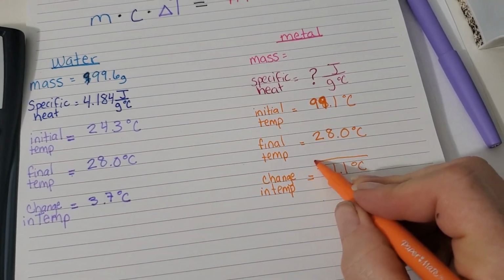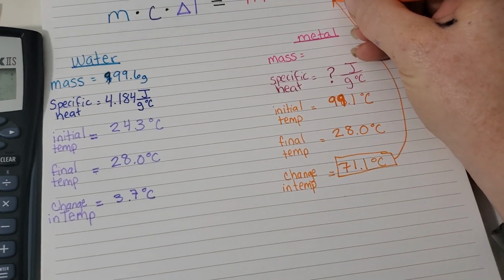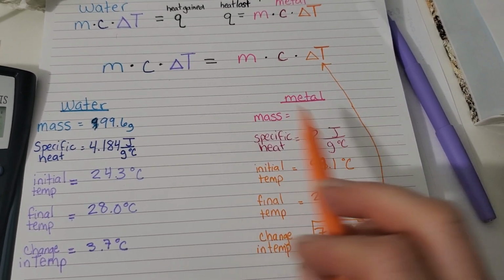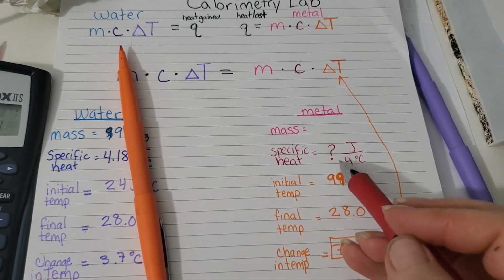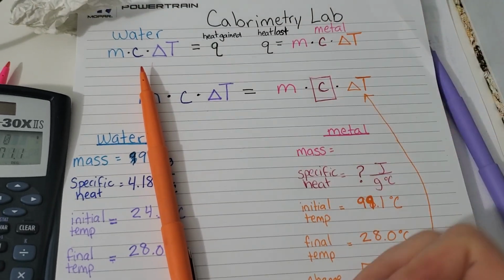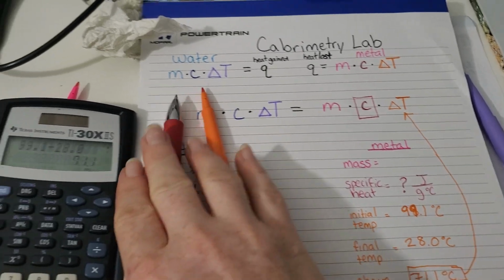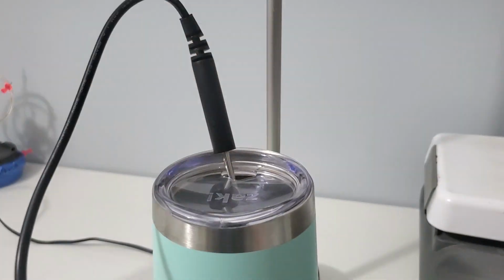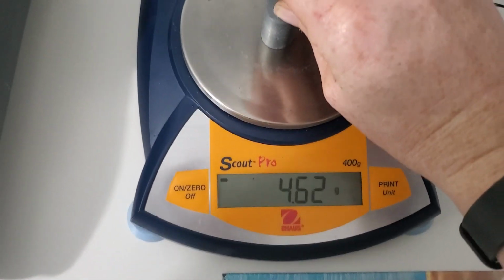Okay. So now I can have this number for my change in temperature. Again, my specific heat, this is the one we don't know. So this is what you will solve for. This is the variable you need to isolate. And we said we would get the mass, so it's been sitting in here long enough to cool off. All right, and then we'll place it on here.